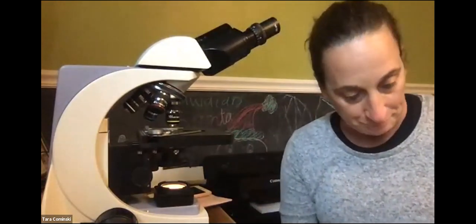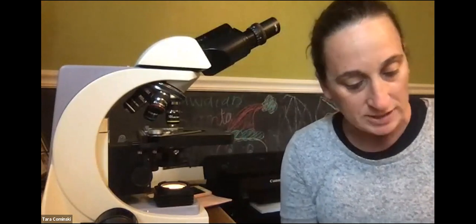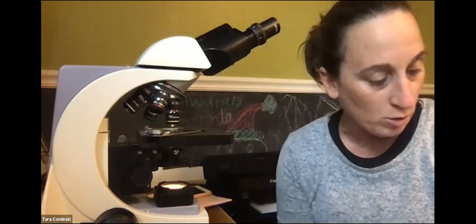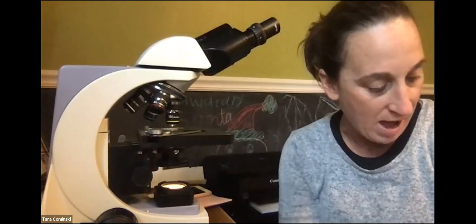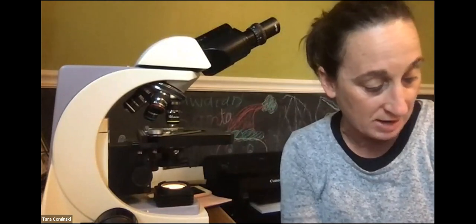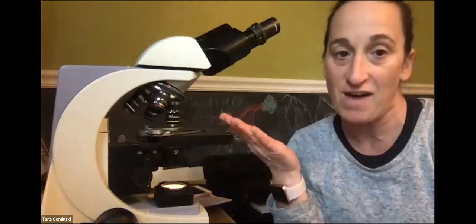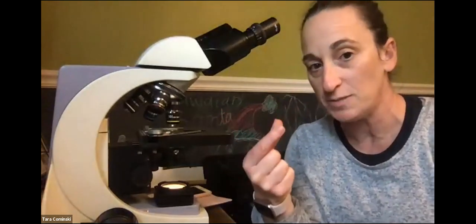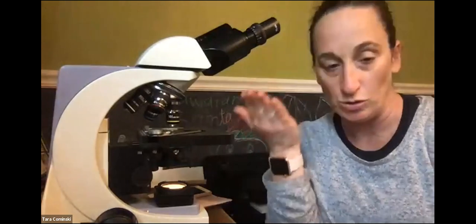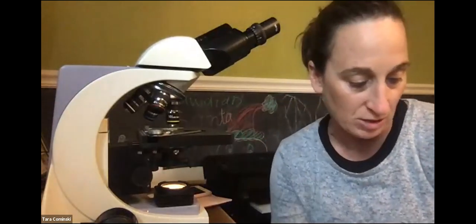All right. So if you look on page 15 there, that's where I am. You can see there's some micrographs, some pictures there that show you a light micrograph, right? So it's showing you a blood smear. So that picture you see in panel A is what, if I had a slide of a blood smear and you looked through the microscope, you would see something that looks like that. Okay, you can see the red blood cells and the white blood cells.